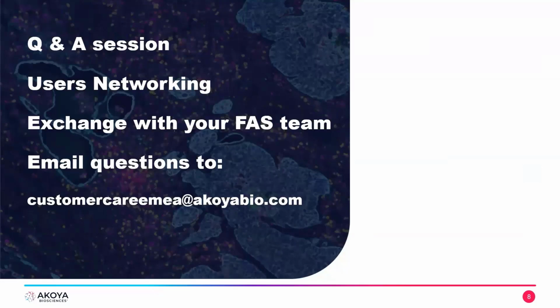Yeah, thank you for the question. Actually, we have been staining the vasculature vessel markers, BBB markers, and assessed the lymphocyte infiltration. We've also done permeability studies, and we know that the T cells, or cells that can enter, need a functional BBB, so they need more normal vessels.